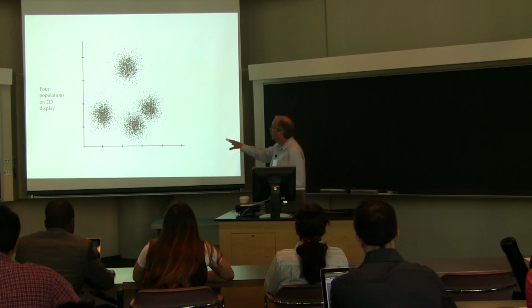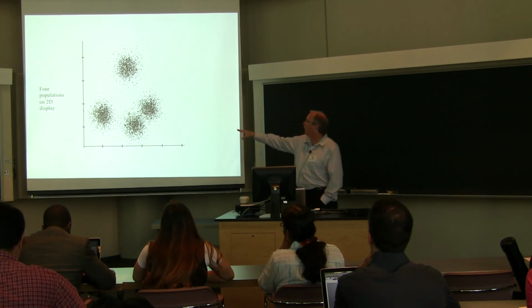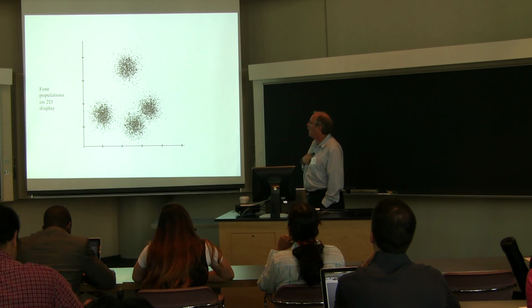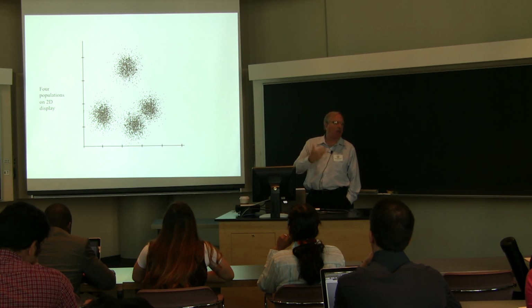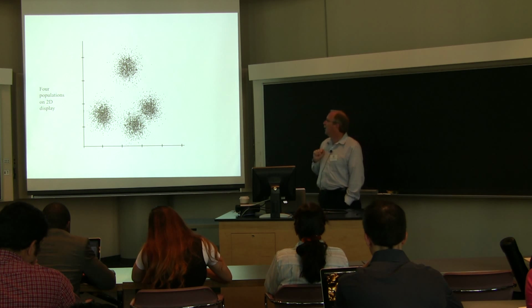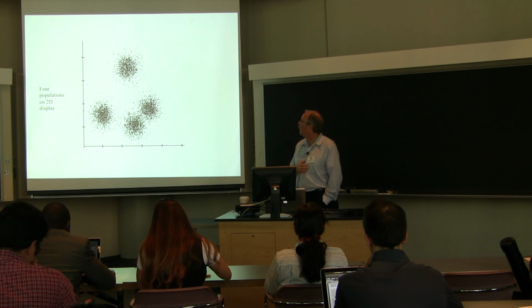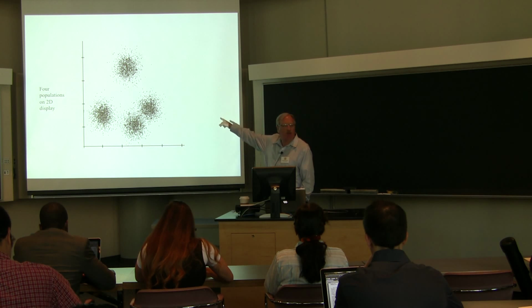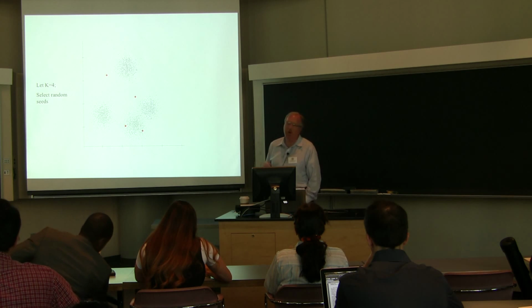In this case, it's pretty clear that we have 4 populations here, and we would want to partition the events into the 4 populations. With K-means clustering, you start out by telling the algorithm how many populations you expect in your data space. So we would tell the algorithm that we are expecting 4 populations, or K equals 4. Then it starts out by randomly selecting 4 events in this data space. And so it might randomly select those 4 events.